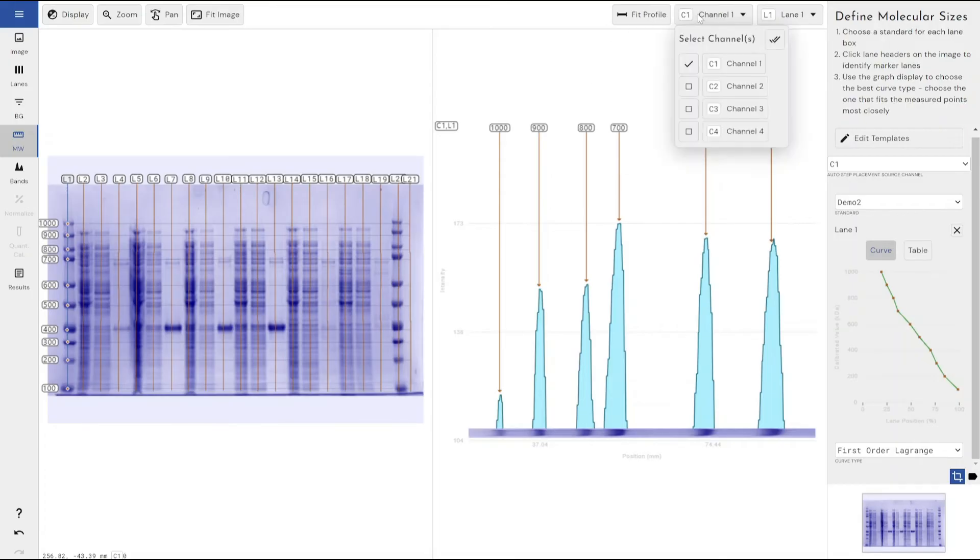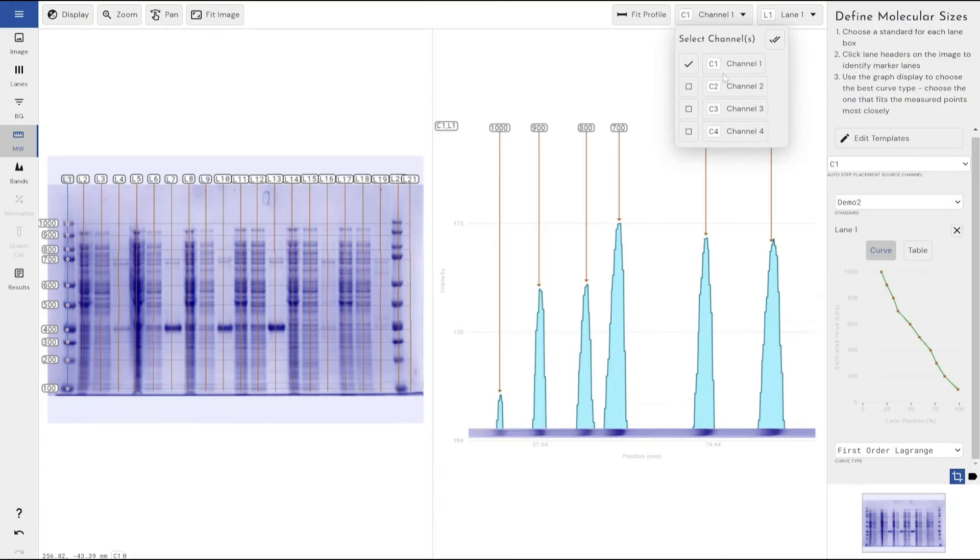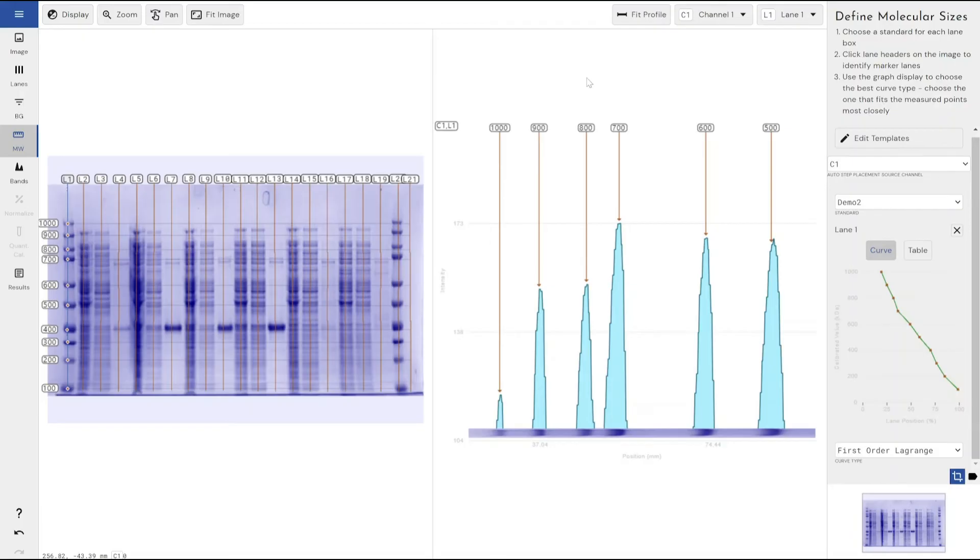We do support different molecular weight ladders on different channels, and we do also support multi-lane, multi-molecular weight ladder lanes within the same image. I'll show you how to do that now.